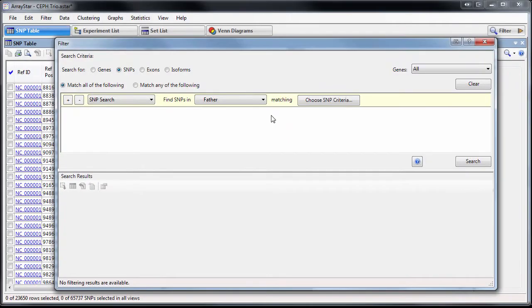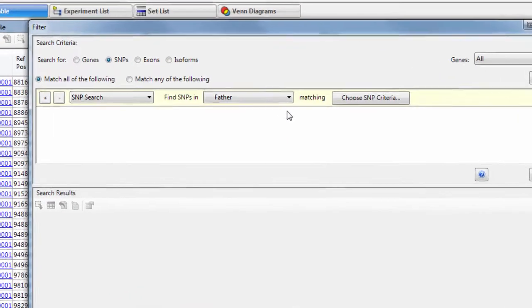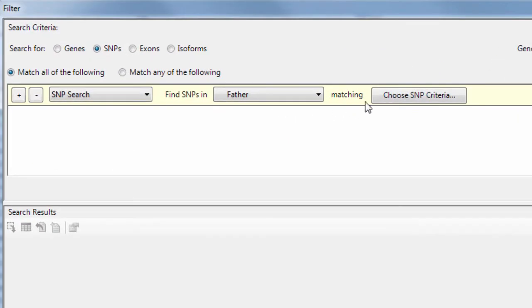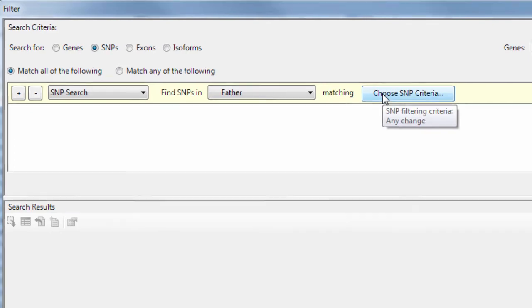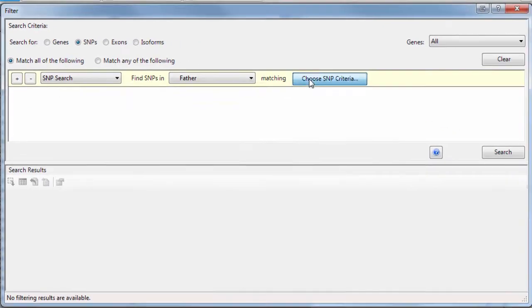Locate important genes, variants, peaks, and other regions of interest using ArraySTAR's robust search tools.